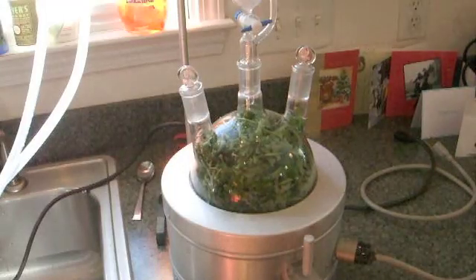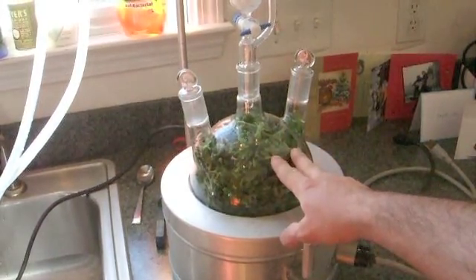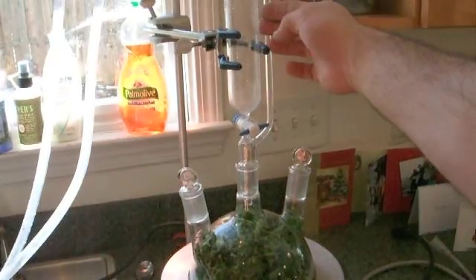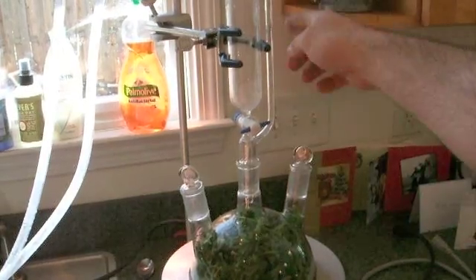We're just filling the sink up with cold water — I'll explain why in a moment. Here's the heating mantle. Here's our two-liter round-bottom flask, to which I've connected a separatory funnel — it's a separatory funnel with a pressure equalizing bypass.